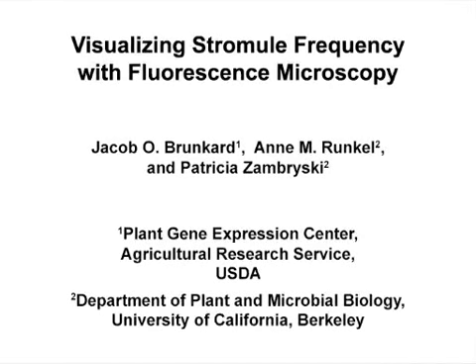The overall goal of this procedure is to visualize and determine stromule frequency using live cell confocal fluorescence microscopy within leaves, and for visualizing stromules in vitro using chloroplasts extracted from leaves. These experimental methods can help answer key questions in plant cell biology and chloroplast research by discovering how stromules function.